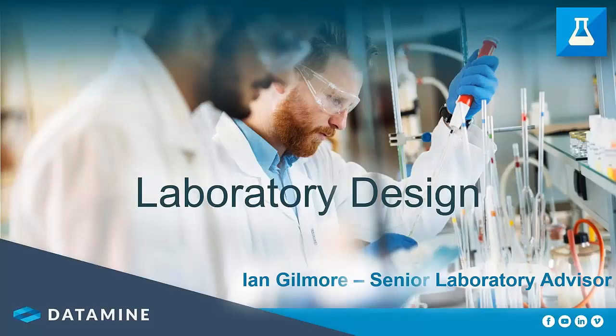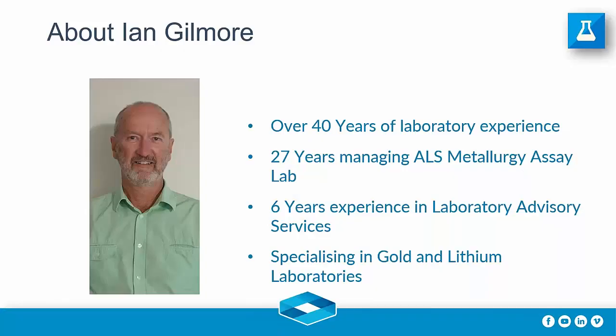Okay, today I'm going to talk a little bit about laboratory design, as Dion said. Specifically, in the case of mine site labs, this is what this is aimed at. The same sort of principles apply to any laboratory that's being built, but specifically mine site labs is the most important part.